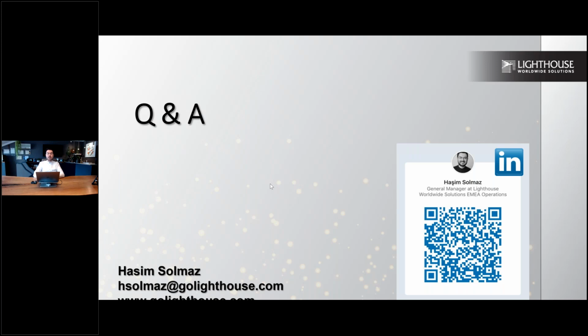So all you need to do is calculate your air changes per hour in order to see the effectiveness of cleanliness and the effectiveness of your air handling unit to return back in a certain time, which is the recovery rate according to ISO 14644-3. This recovery rate gives you the protection index. You can set a certain number as the protection index, and then you can perform this recovery rate testing instead of the smoke test.